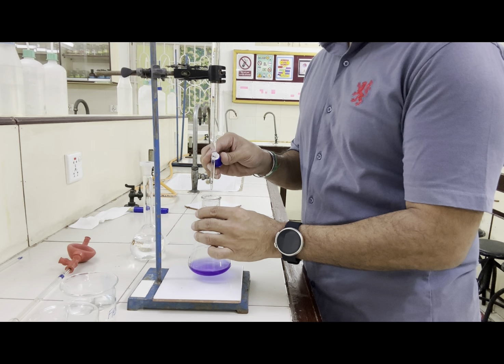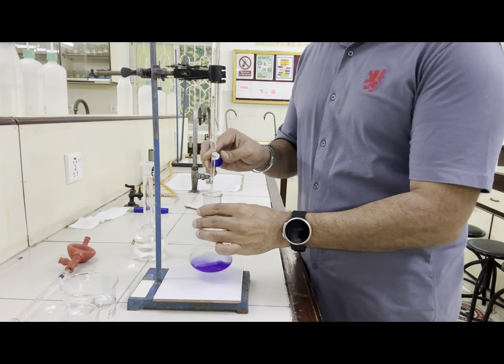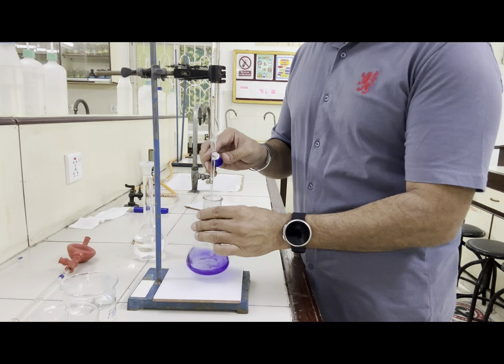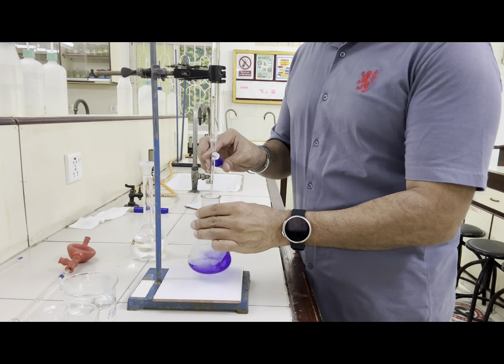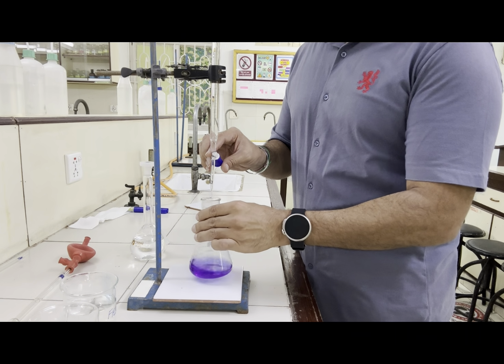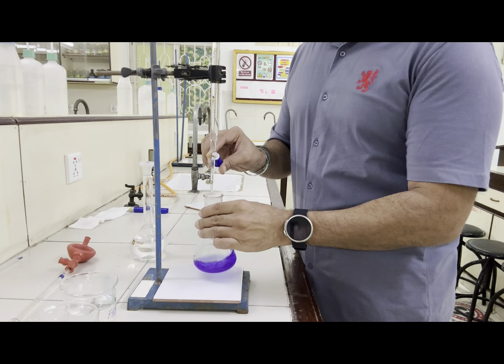That is the accurate titration. So let me show you how. First of all, I am adding a bit faster. As soon as the solution turns lighter, I will stop it to dropwise.